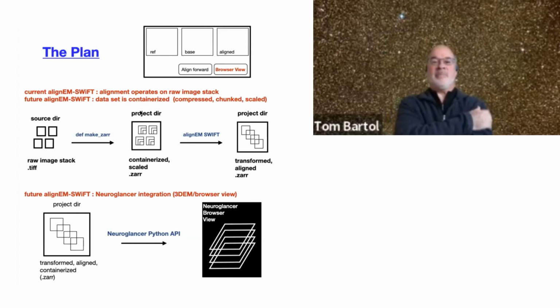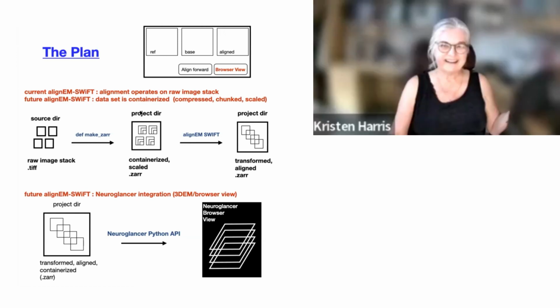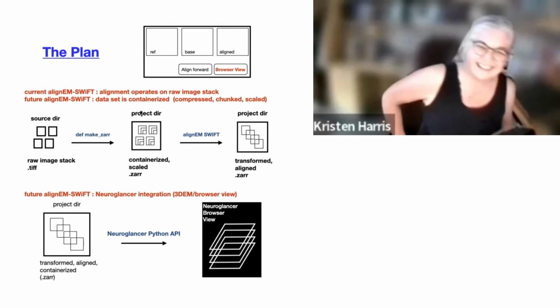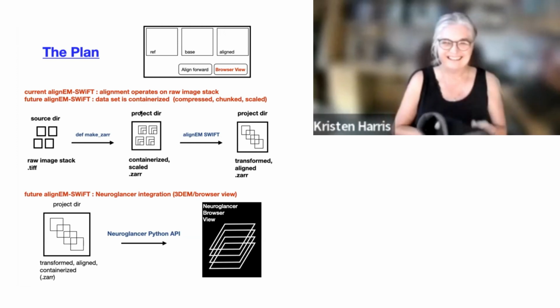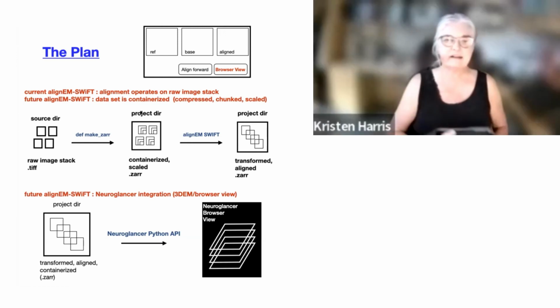So it's connected. You open it up, and you can see where the data is from and what the conditions were. Yeah, that's a good question. Normally we're blind as to condition, Terry. You can blind it too, but the point is that there's a link somewhere.